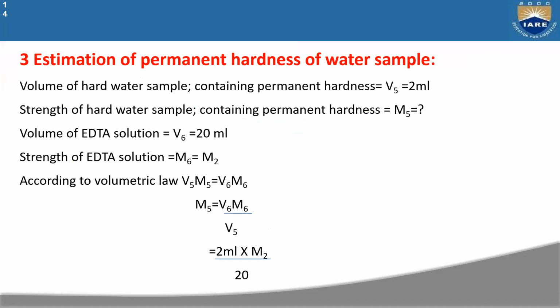Volume of... so strength of EDTA solution M6 is equal to M2.